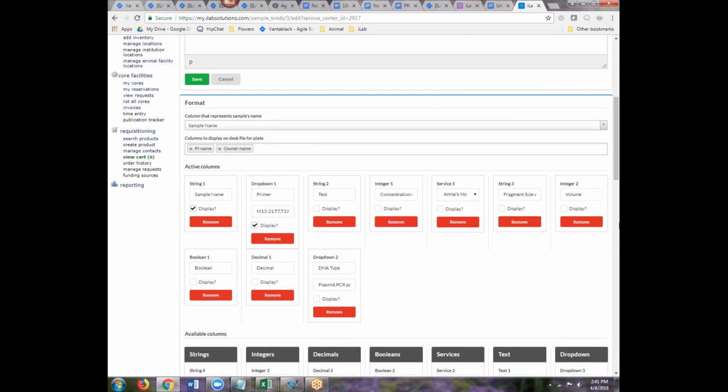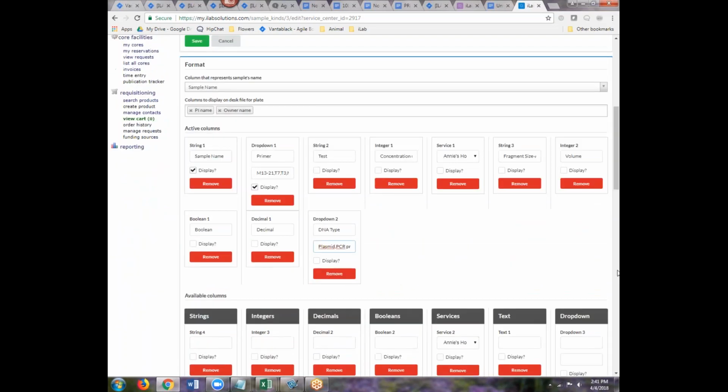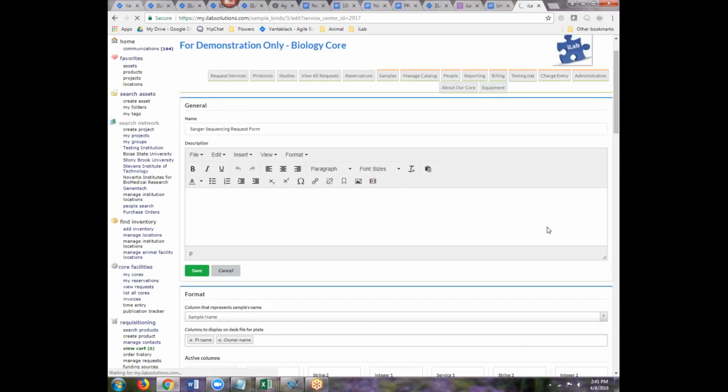They build this form using several different kinds of fields that they can include. So if they want to include, let's say, drop-down fields or text fields or numerical fields, they can do that. They can give each of these fields a name, and choose the type of field it's going to be. If it's going to be a drop-down field, they populate it with all the entries that they want their customers to choose from. And so they build their request form, again, per processor. Maybe not the prettiest of screens, but it's functional. It's one of those things we will come back to and improve.